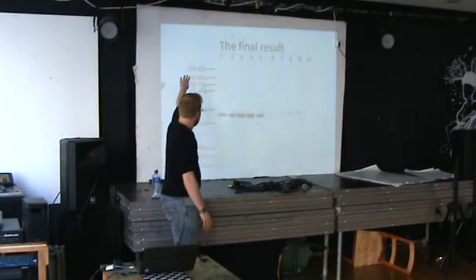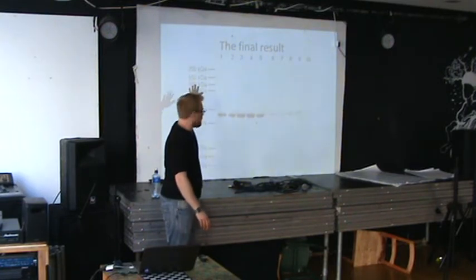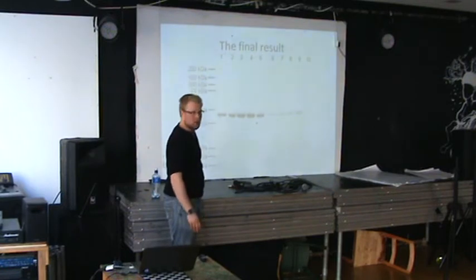So you can see, I was saying we sorted our protein by size when we did our gel, so that's why we get all these different sizes, because I said we ran a marker alongside.